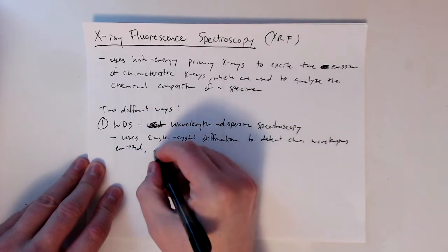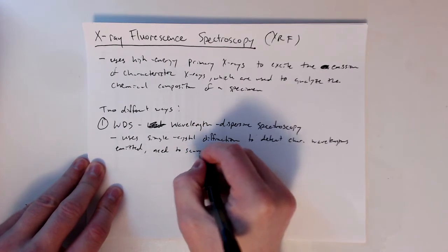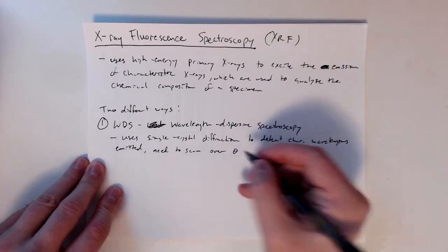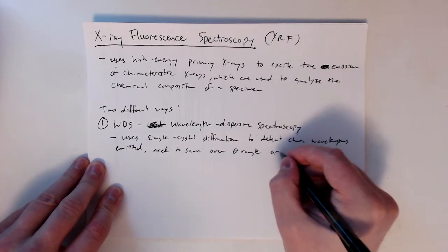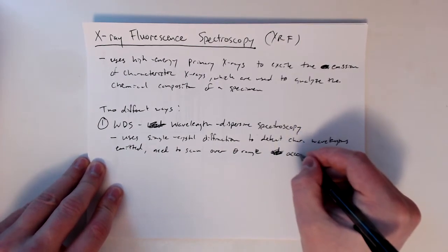And so we need to scan over a range of theta angles according to Bragg's law. Spelling today is not going great.